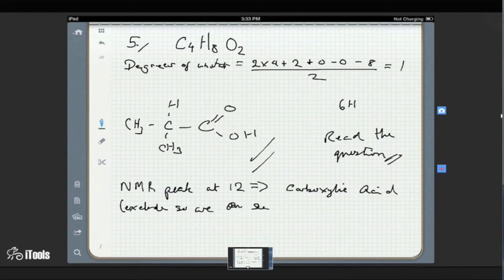Also, notice, just to review, you can check your notes for this. Where do aldehyde hydrogens absorb? From 9 to 10. And where do carboxylic acids absorb? 10 to 12. That's right. At first, you guys weren't sure if this was an aldehyde or a carboxylic acid, but the important thing is that you checked your notes and then you saw. So you can see those are really very helpful absorptions, right? Because nothing can be in 9 to 10 except aldehydes. It guarantees it's an aldehyde. And nothing can be from 10 to 12 except a carboxylic acid. So that guarantees that it's a carboxylic acid group.